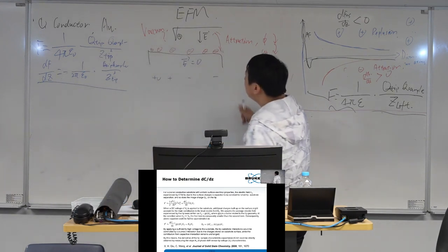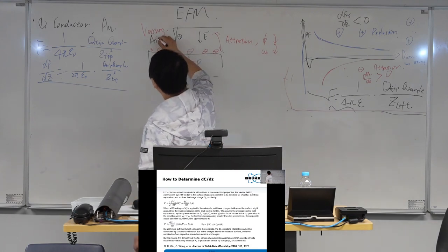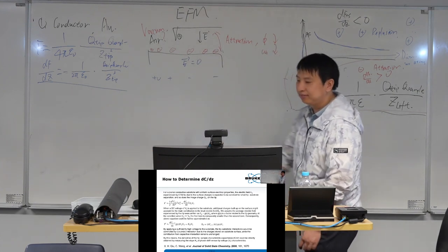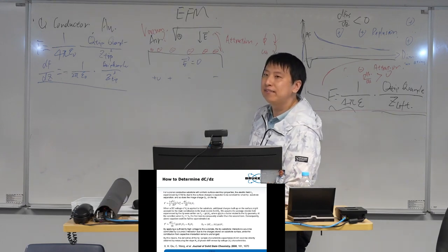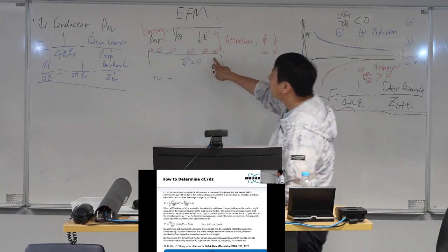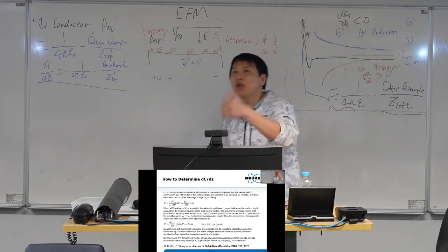Okay. So if we place this thing in a different medium, in this equation, which term will change? Which term will change? We still have the Q tip, we still have the Q sample, we still have the Z tip. Which term will change? The dielectric term will change.